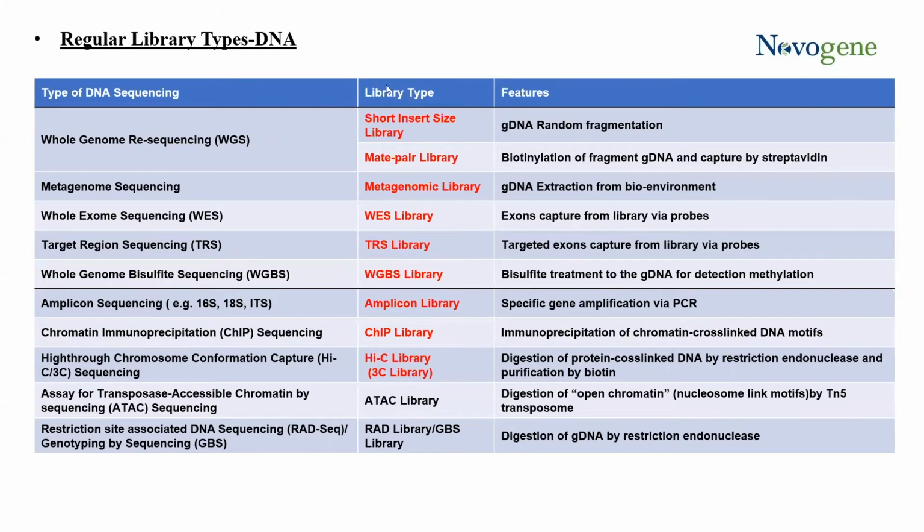So why is this a concern that we should be scrutinizing these types individually? Is because all of these will produce different segments of information, right? So if we're dealing with amplicon-seq, we could have a high degree of repeats, and we would want to offset that with running this on a lane with something else, a divergent species or a different library type all in itself. Metagenomic studies, these typically tend to be pretty well balanced.